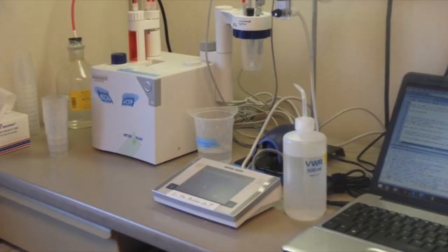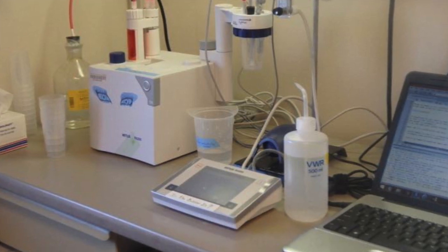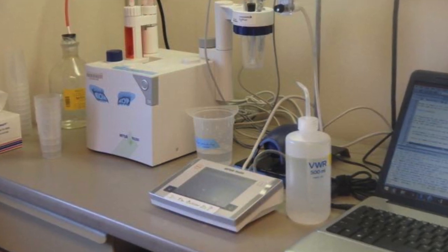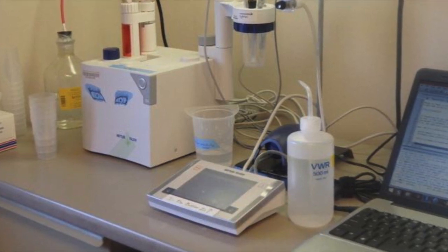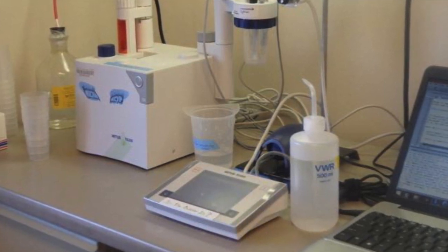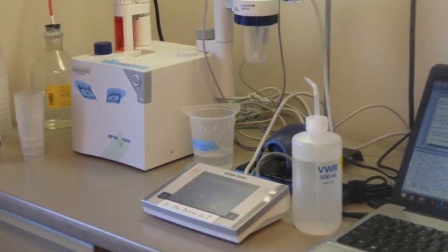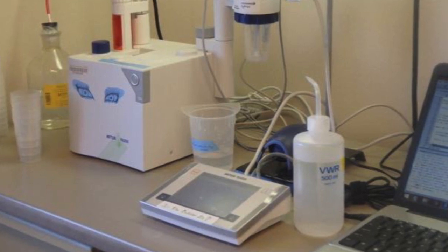Next, alkalinity is determined. This test measures the buffering capability of the water. This is how much the water will resist a change in pH when acid is added. Specifically, it measures the carbonate and bicarbonate levels. When you combine the results of both tests, you can do some crazy complicated math to get the carbon dioxide concentrations. My team programmed the computer to do this calculation for them, which makes the whole process much faster. That's why I have all my students learning to code. Scientists, as well as lots of other jobs, benefit from being able to write code.